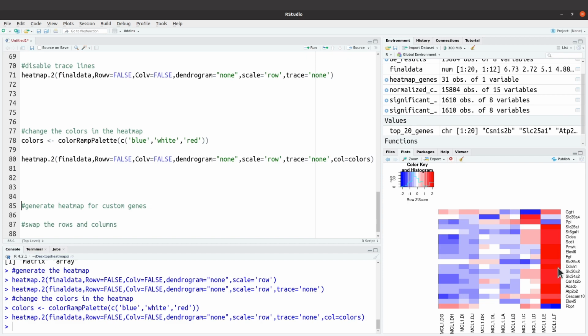So what I want you to focus on is the colors, and then comparing them. For the genes, it doesn't matter where they are, they will still have the same color intensity because they are being compared to each other. So that's what you need to know.